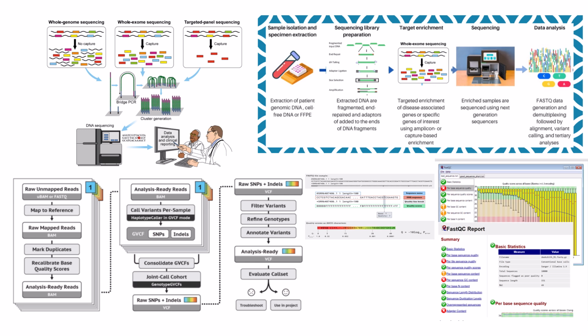And then finally, these annotation databases. What do they do? Yes. Think of these as the specialized encyclopedias. So the reference genome and variant catalogs help us find variants and see how common they are. These annotation databases come in later, after we've found potential variants. Okay. They add layers of biological and clinical meaning. They tell us things like which gene is affected, what this change might do to the protein, and whether this specific variant has ever been seen before in patients with genetic diseases. That kind of crucial context. So phase one is all about assembling the toolkit, the library you need for the analysis. Exactly. Building that essential library of resources.